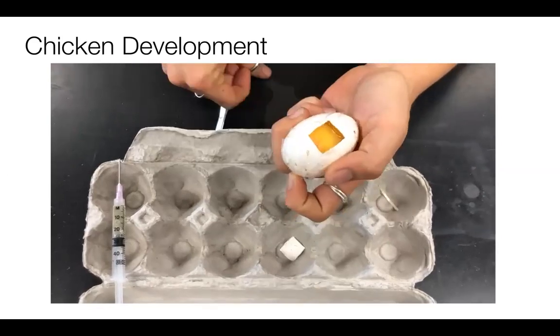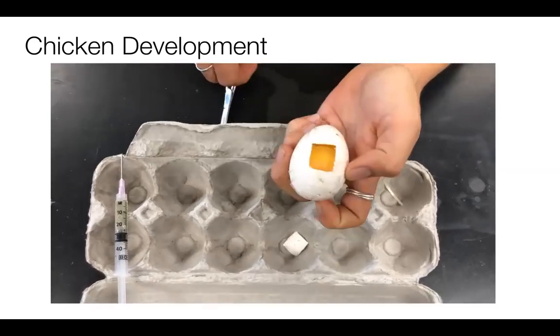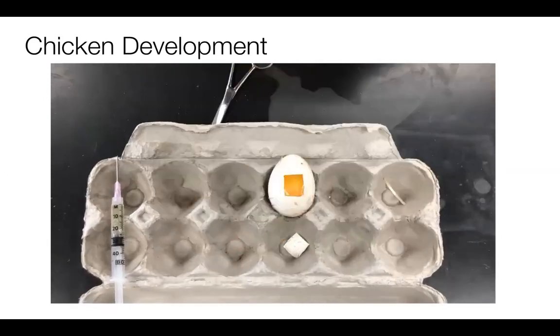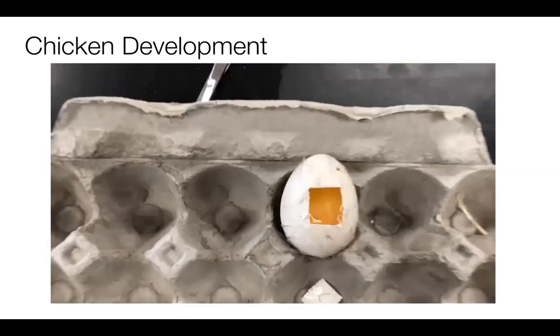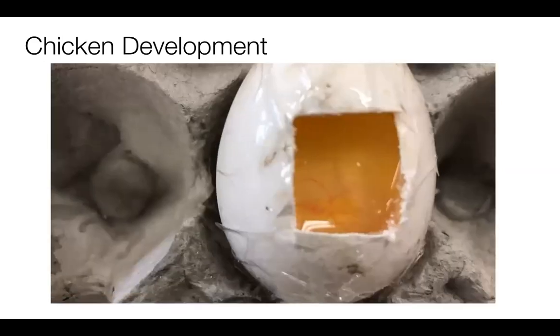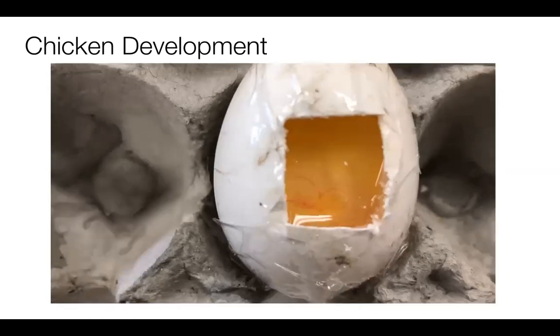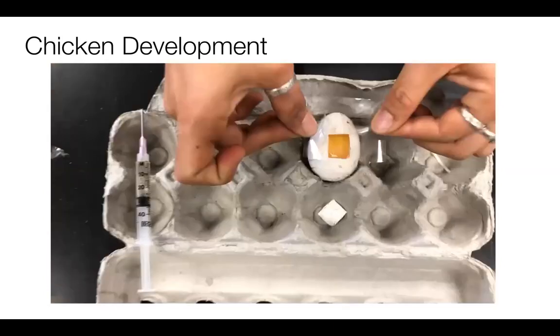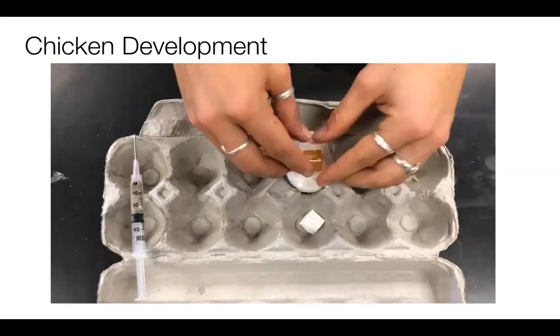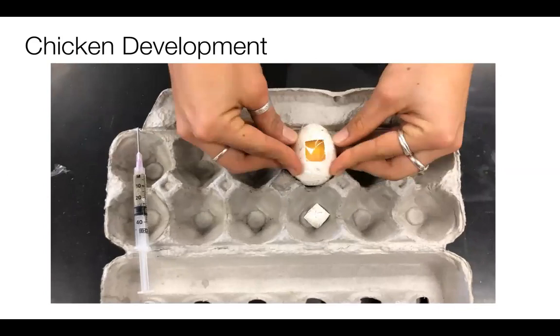And there's our embryo. If I tilt it and put it down, you should be able to see the embryo. And here we can see the heartbeat of the chicken. This is what you're going to be looking at in lab. After that, you'll do a drawing, and we're just going to place a piece of clear tape over that so it doesn't leak out. And that's it.